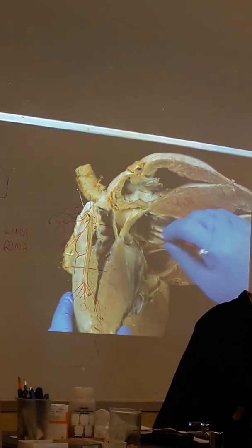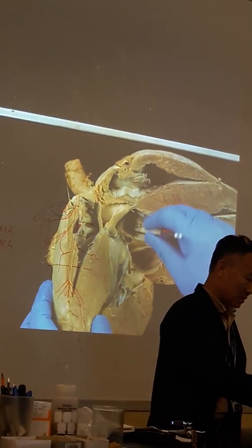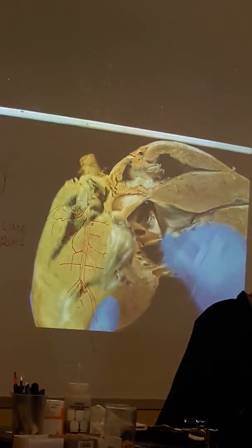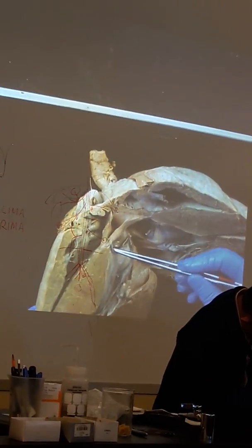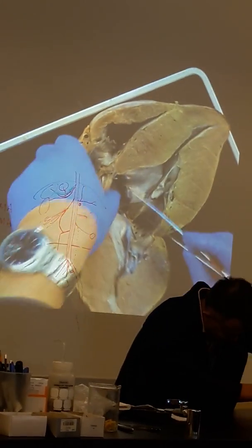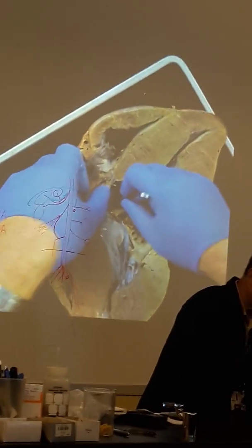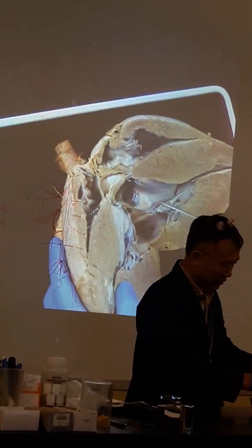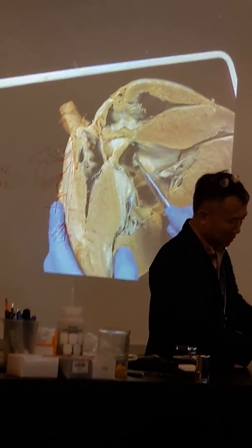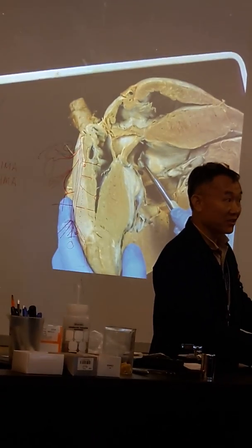It's just about, you see, one here. That's one of it. Another one is going to the right side. Okay, it's much smaller. Yeah, it's over here. Okay, that's right side. This is left side. So when the heart is pumping blood into the aorta, this one you see, going up, half of the inches of the opening or orifice.